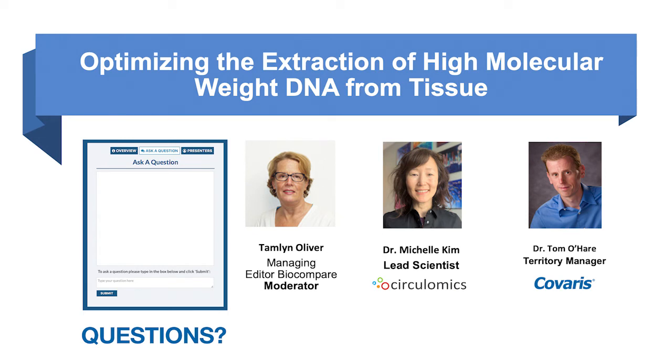Okay, here's another cryoPREP question. What size tissue samples are you starting with for your cryoPREP sample workflow? Generally, we recommend our users always start with approximately 25 milligrams of tissue. And as I mentioned in the talk, different tissues will have different nuclei density. So for some tissues, 25 might be too much. For some tissues, it might not be enough. But we always recommend starting with 25.